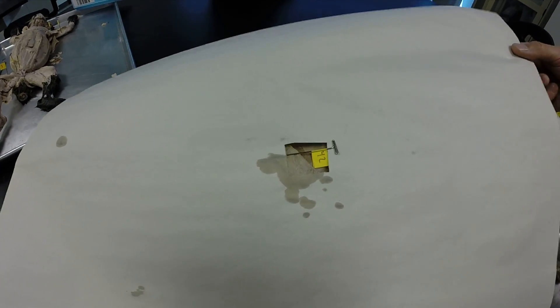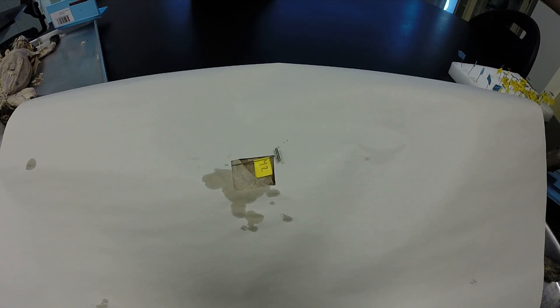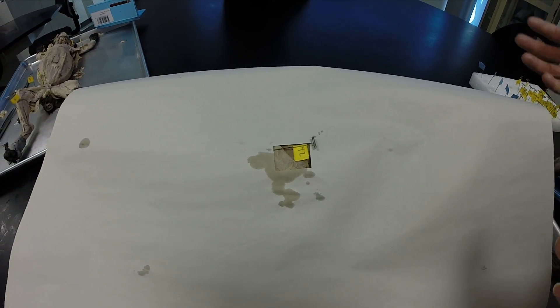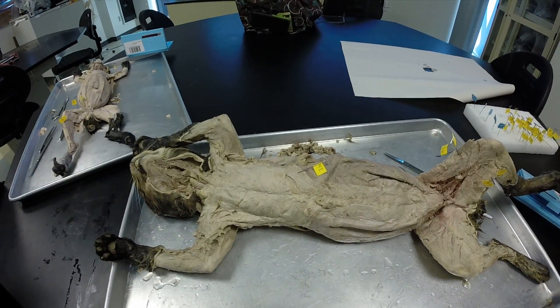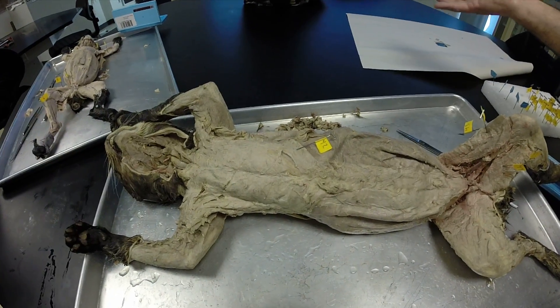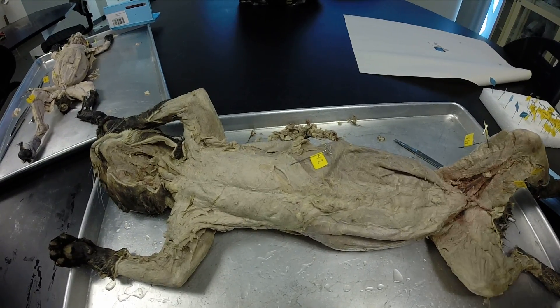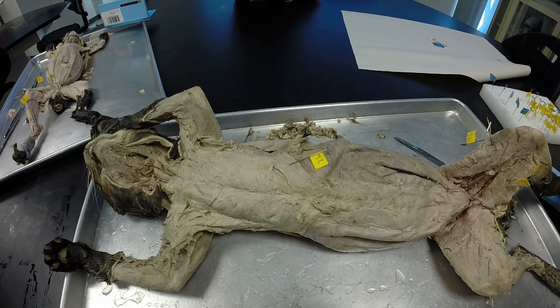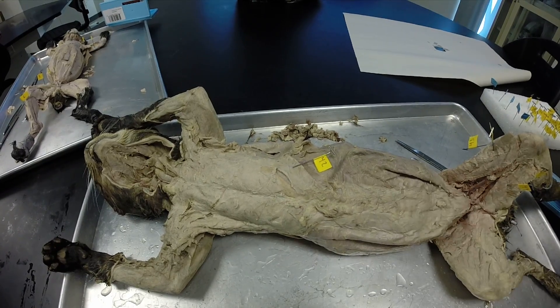What you need to do is keep in mind that you have the whole cat, so use the whole cat. Students tend to focus on what's being pinned and if they don't know it, they freak out. So look at what's around it. Identify the muscle next to the muscle that's pinned — that could help you check. Learn the muscles in order in different sets if that works.